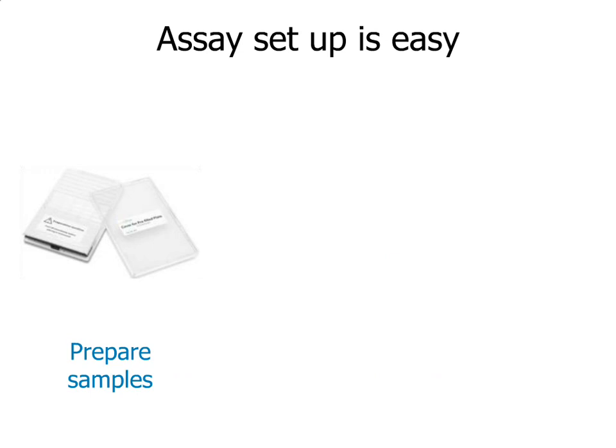And Catherine, in a little bit, is going to go through the steps that her group at Emerald Therapeutics has gone through to actually automate this process as well. At the bottom of the plate, we have pre-filled the plate with the reagents that you would need with every single experiment, such as the separation matrix, stacking matrix, and running buffer, so you don't have to do that every single time, cutting back on some of the hands-on work that you would need to do for each experiment.